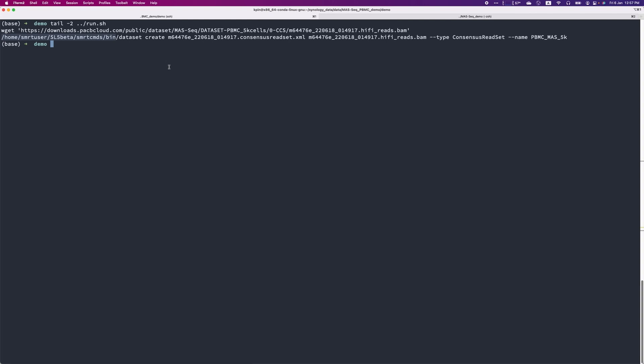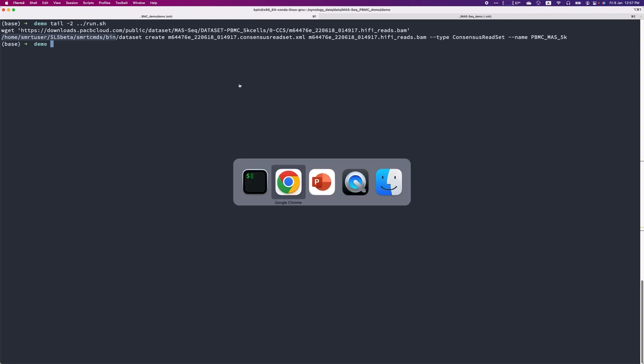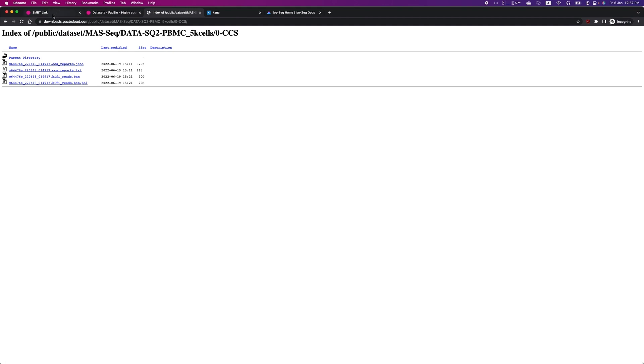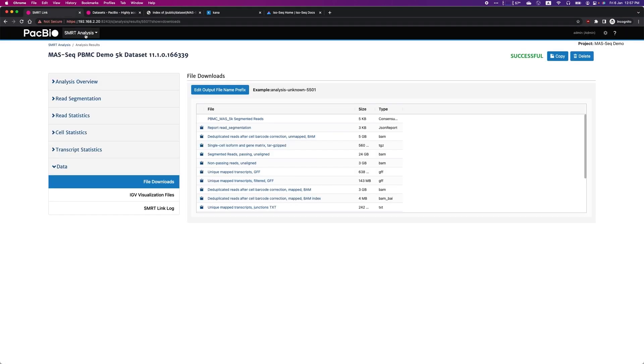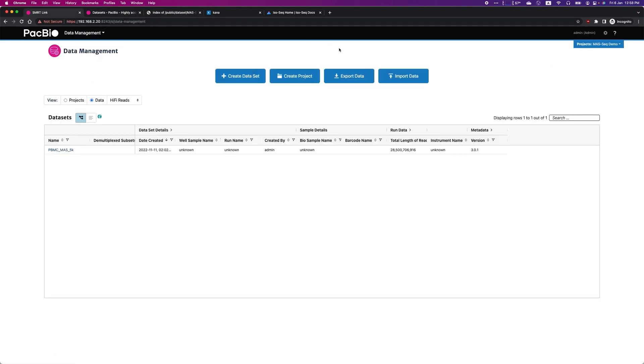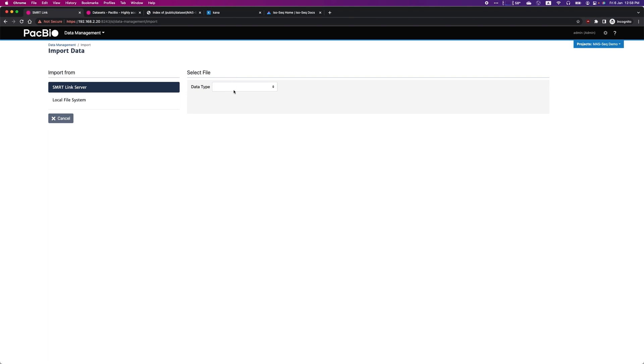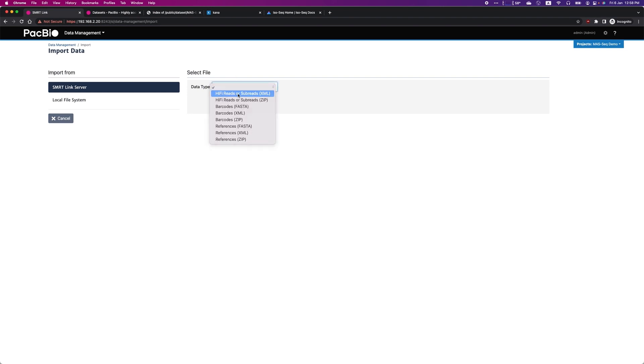Once you have created the XML file, you can now go to SmartLink. Under Data Management, click on Import Data, select HiFi reads or subreads XML file, and point it to the XML file that you have just created.